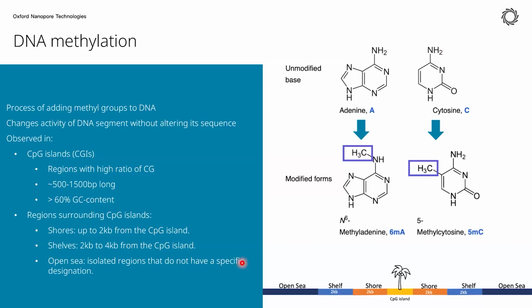We're having fun with the whole CpG island, shore, shelf, and open sea idea of human DNA methylation. But we do have a pipeline specifically.